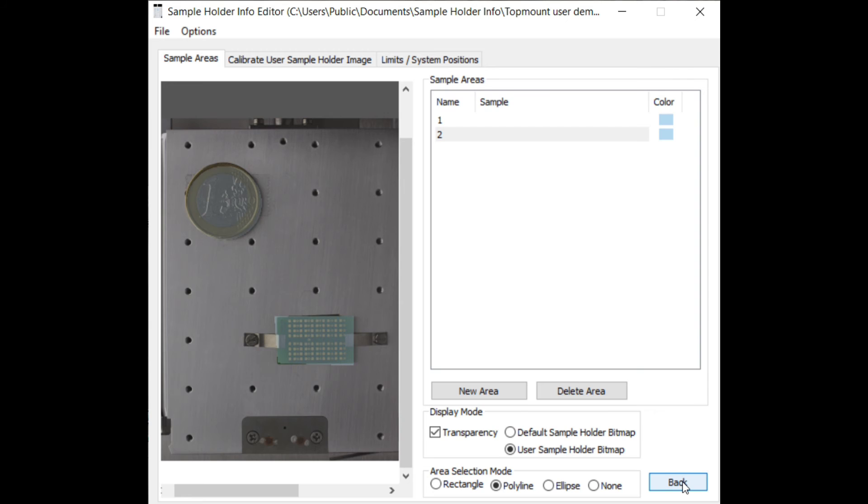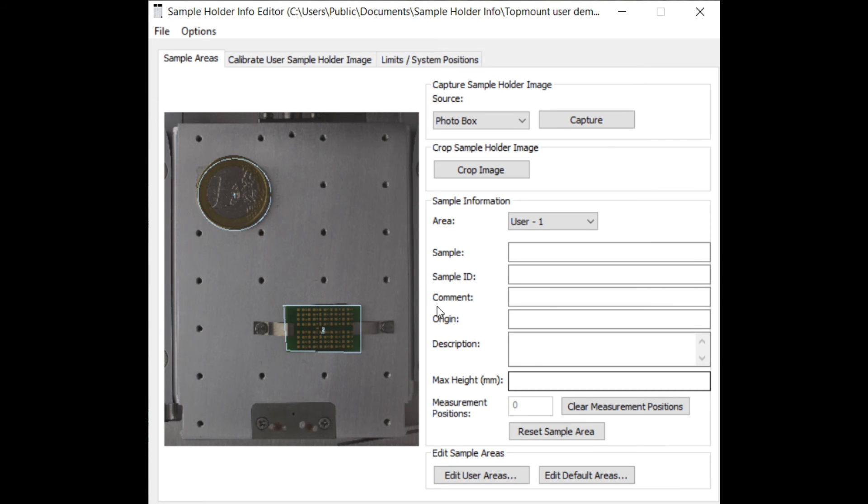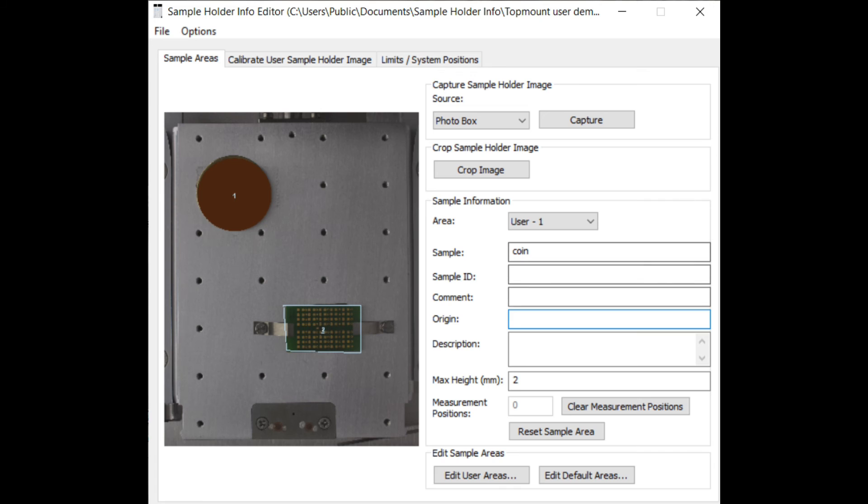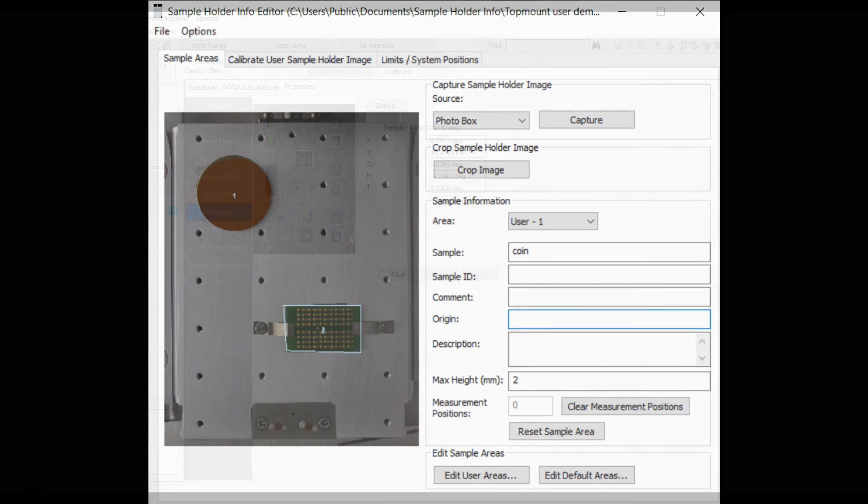Then go back to the sample area screen and enter the sample information and sample heights to the respective areas. To use the topmount navigation it is necessary to fill in a value for the maximum height of the sample. Make sure that the entered height is equal or higher than the actual sample height. The value can be updated later at any time to a more accurate number.